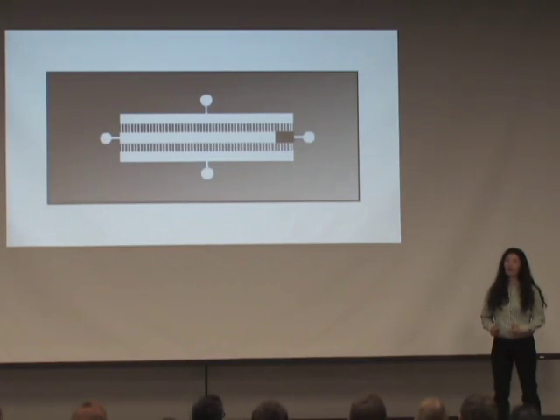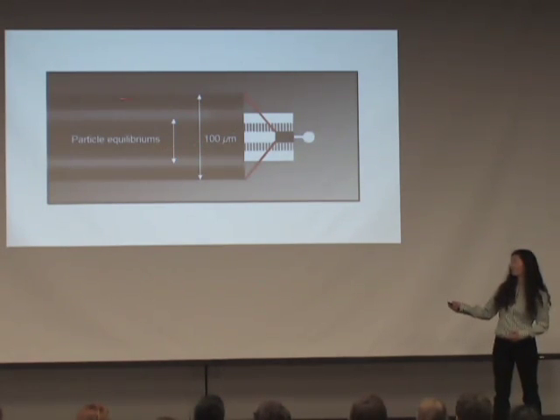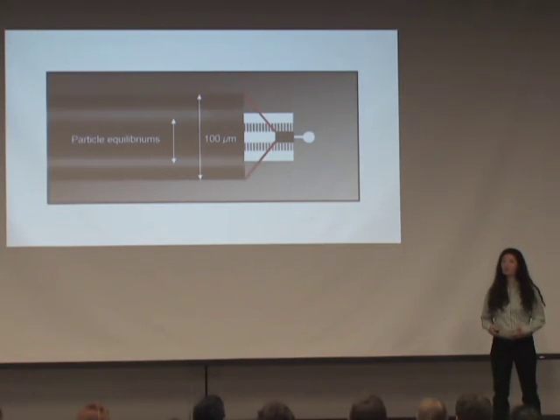So, I'm looking at the end of the permeate channels, and I'm using fluorescence microscopy to take long exposure images of my particles. This gives me a look at the probability of the particle's location. So the white streaks that you see are where the particles are most dense, the particle equilibriums. We also use the long exposure technique to show an accumulation of many particles to get a better sense of the fluid flow instead of just tracking one particle.